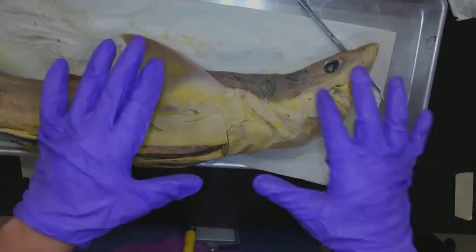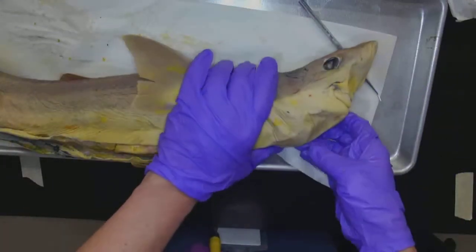Okay, so that was placoid scales. I don't know why I blanked out on that, but placoid scales are what chondrichthyes have.